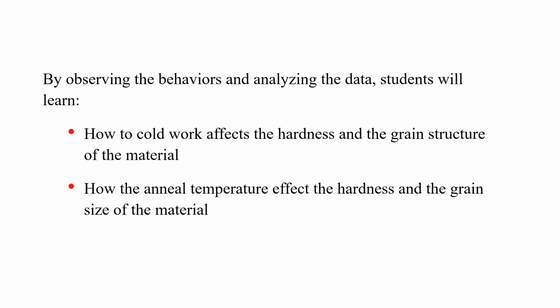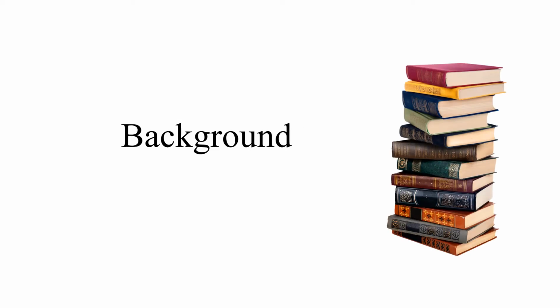After these experiments, you will learn how cold work affects the hardness and the grain structure of the material, and how the anneal temperature affects the hardness and the grain size of the material. Background: cold work.